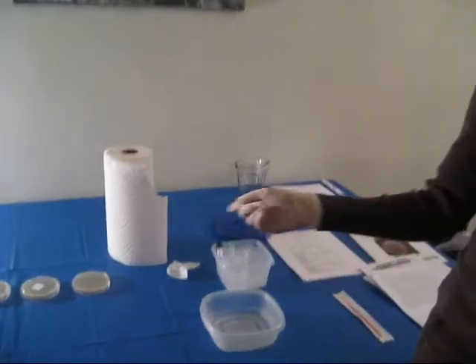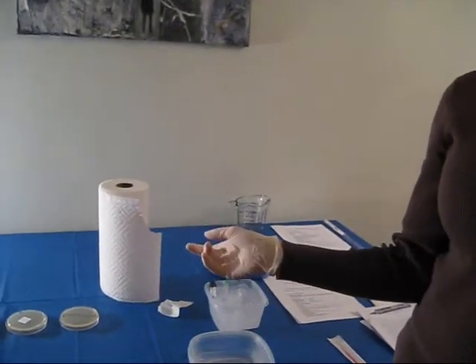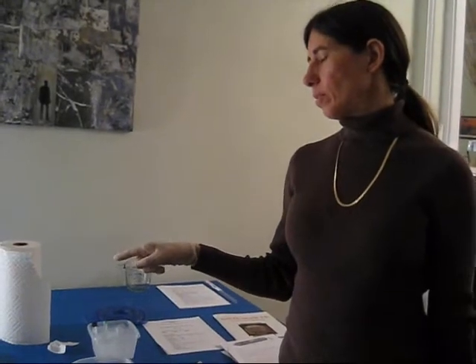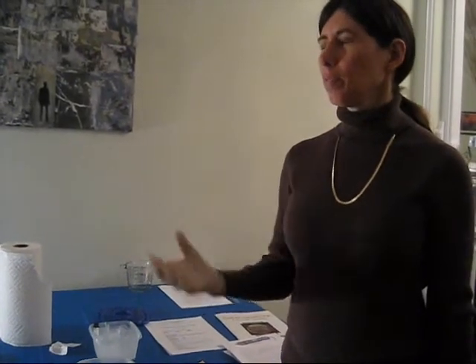These two plates have ampicillin on them and this one doesn't. What do you think would happen when we plate the bacteria without the plasmid onto the ampicillin plate? Should they all die out? Right — so we should see nothing on that plate. And what's going to happen when we look at the ampicillin plate that has the bacteria with the plasmid? They'll glow. Hopefully they'll glow, yes.